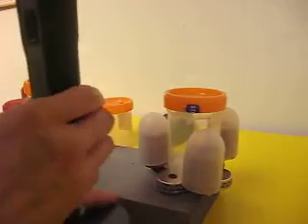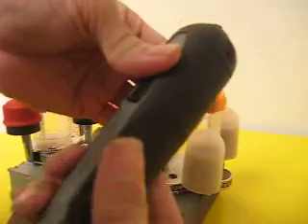With this new driver, it has slimmer gripping place so it's easier. Plus you just press it down instead of holding it. I'll demo it in a minute.